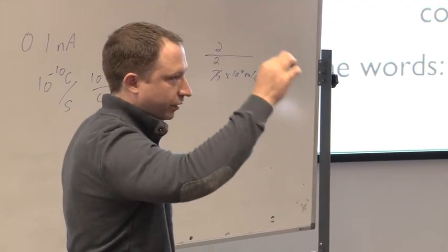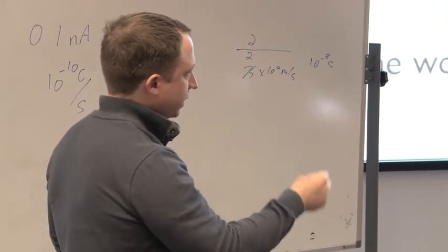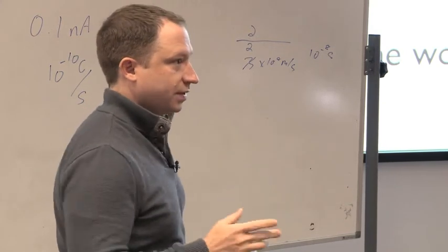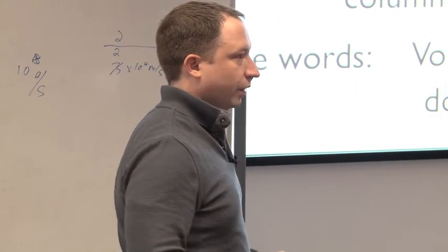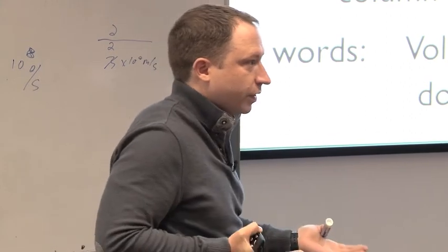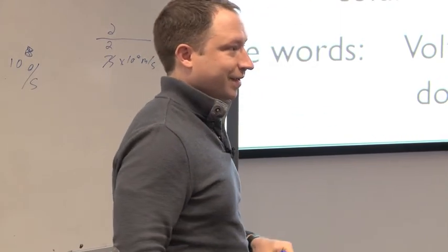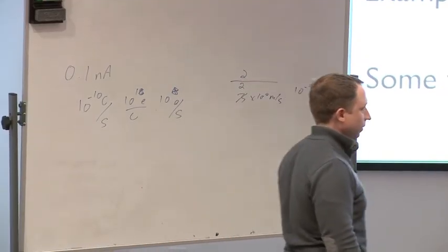So these electrons are coming through this, they come off the top, and they shoot down, hit your sample, and hit the detector before the next one is even rolling through. So this is wild. And the reason it's wild is because Shore's just spent an entire lecture explaining to you about how these are waves and how we use them, the waves of each electron interfere with each other, and we use these to make images. But how the heck can they interfere with each other when there's only one in the column at a time? And so this is really deep mysteries, and this requires quantum mechanics to understand it.